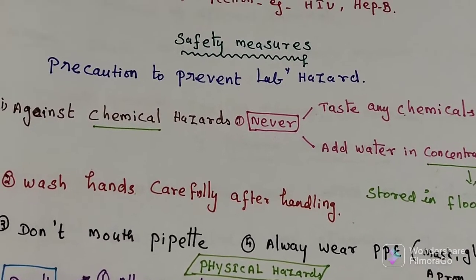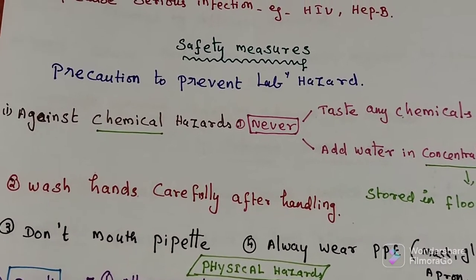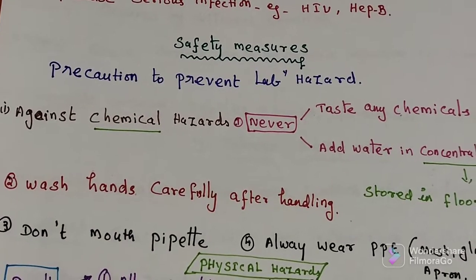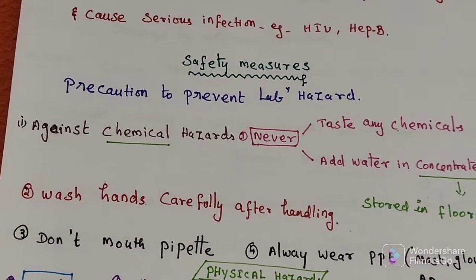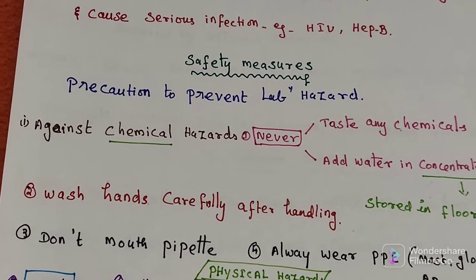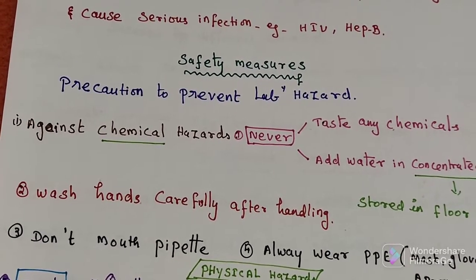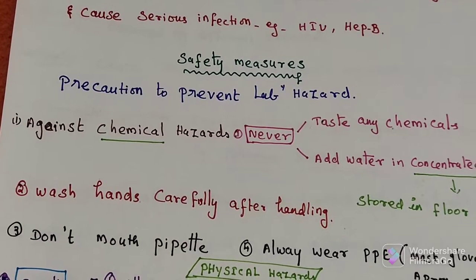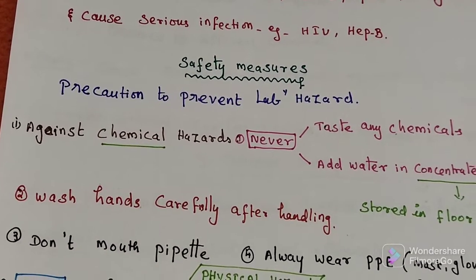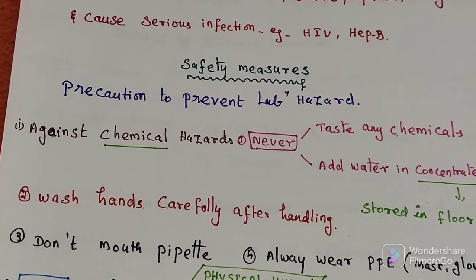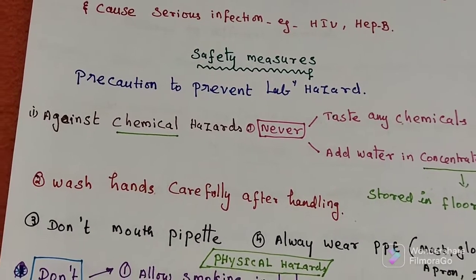Next is safety measures. The precaution taken to prevent laboratory hazards is called a safety measure. We will now discuss chemical hazard safety measures.